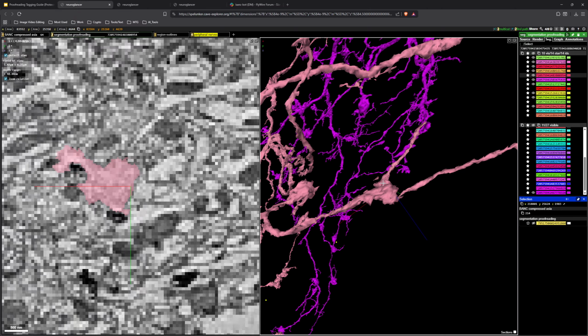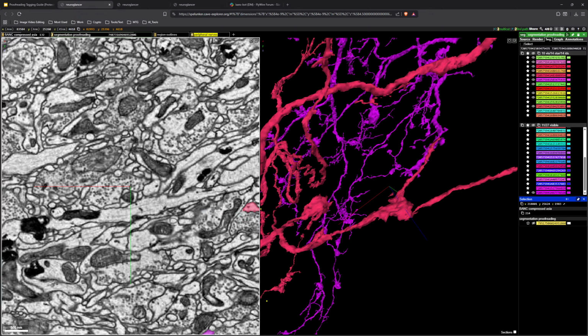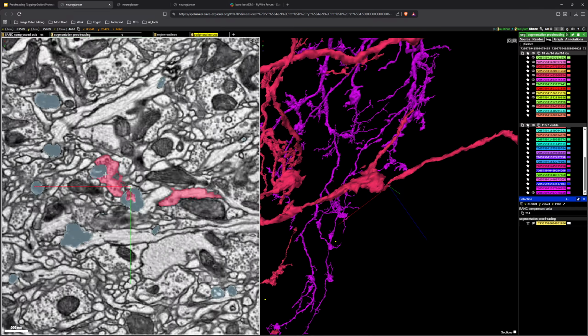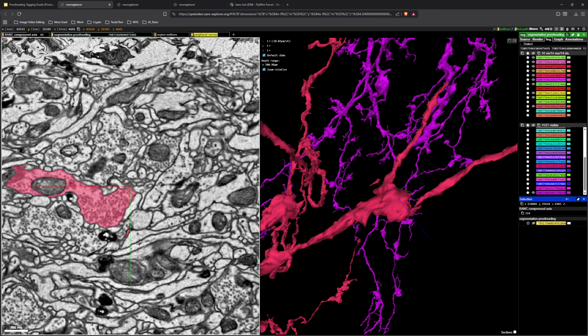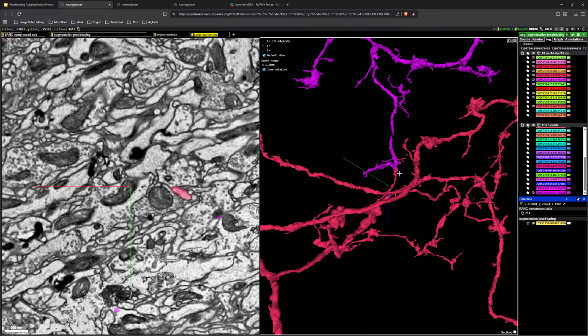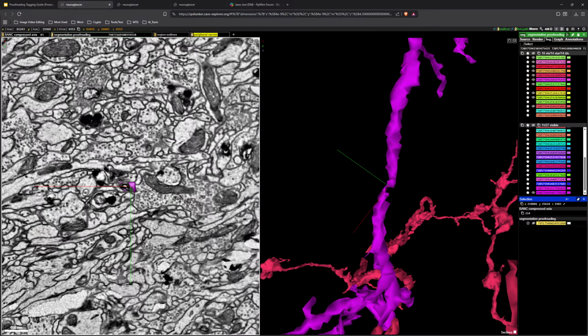As you can see, we can check this one real quick. This is some type of axon, and the connection goes this way. We turn the alpha off. We can see that the connection is quite smooth with these vesicles, and there, that connection is also quite nice, so that is fine. So if the connection is good that way, then we can reliably say that there's some broken part here. And we can see there's a little bit of very thin connection there.